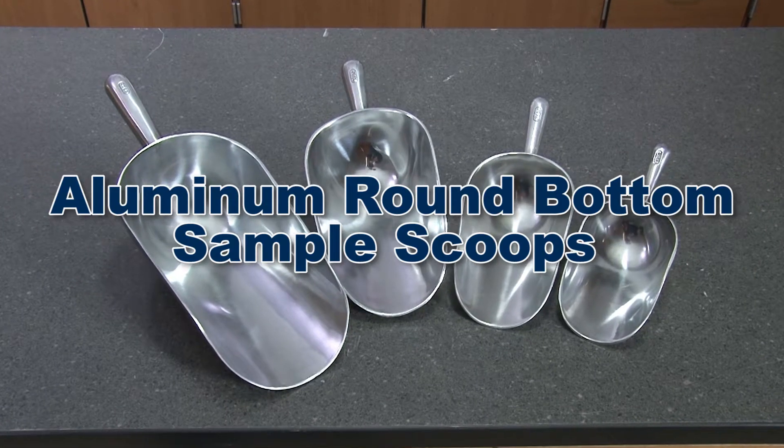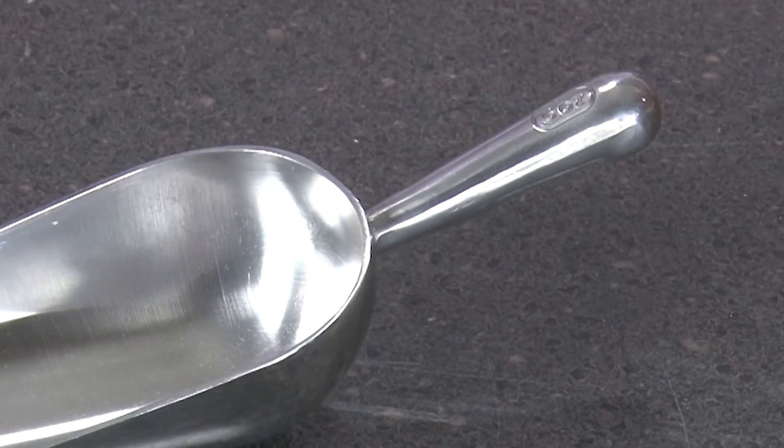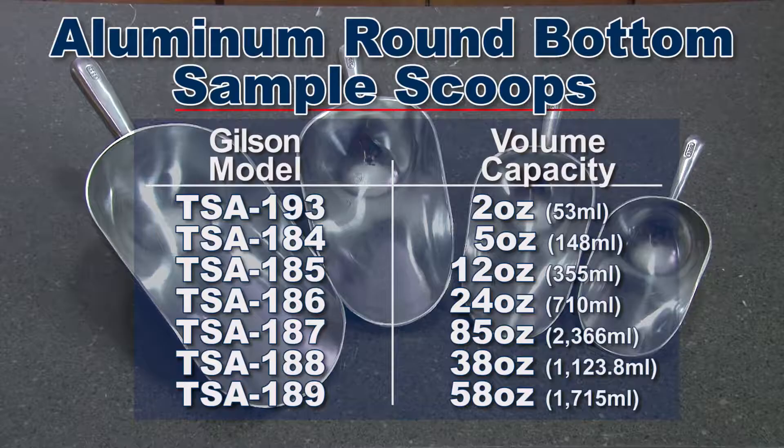Aluminum round bottom sample scoops are constructed of die cast polished aluminum and have a rigid sure-grip handle. These rugged scoops are useful for handling fine or heavy sample materials and come in 7 different volume capacities.